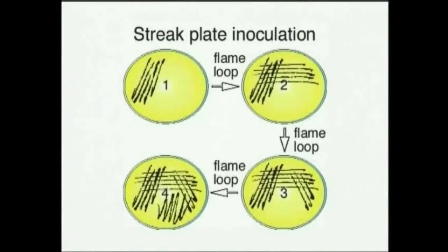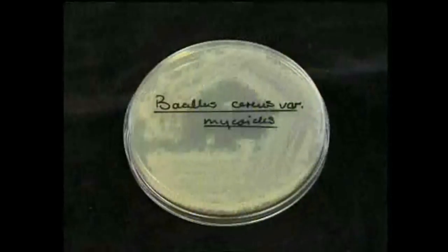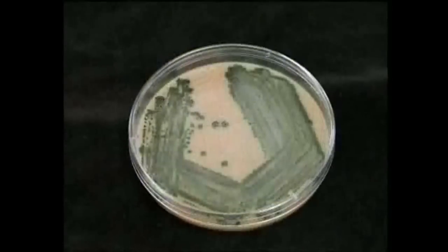The plates are inverted and incubated. If the streaking has been successful, colonies should be clearly visible on the plate after incubation. Growth is confluent around initial streaks where the colonies grow and merge. The aim is to deposit most of the bacteria in the first few streaks. The subsequent streaking has a diluting effect, producing isolated colonies.